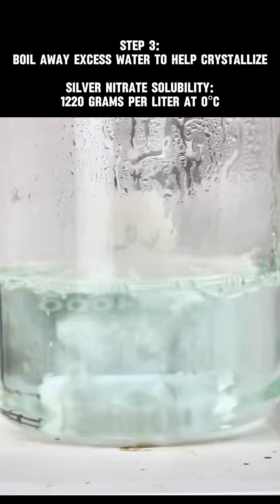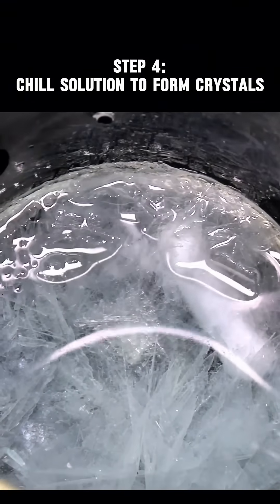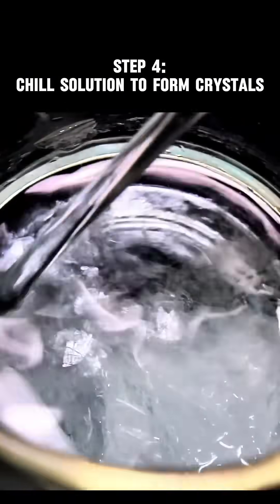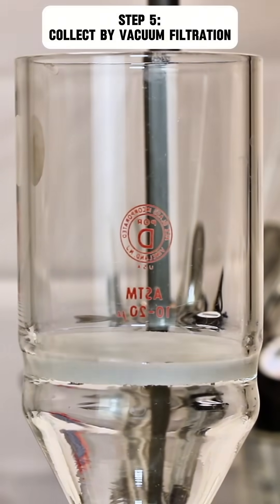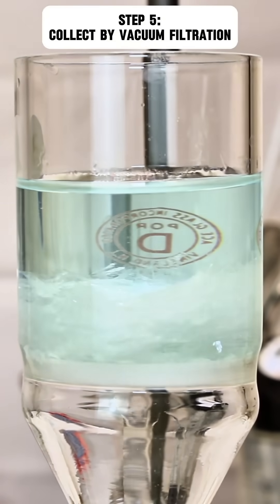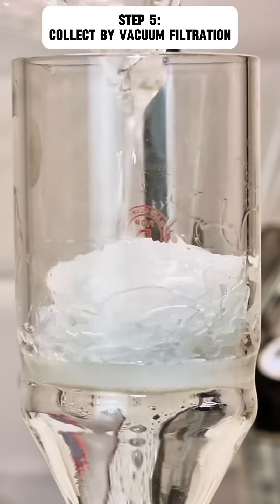Once the volume had reduced significantly, I placed my beaker on ice to crystallize my pure silver nitrate. This chemical forms in beautiful translucent platelets, and it's one of the few soluble silver salts. As a final step, these crystals are collected by vacuum filtration and desiccated for a few days until they're completely dry.